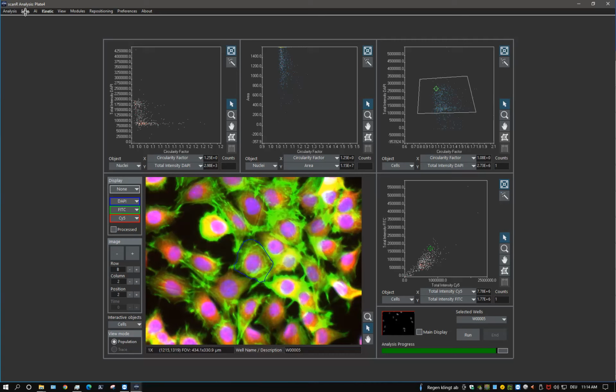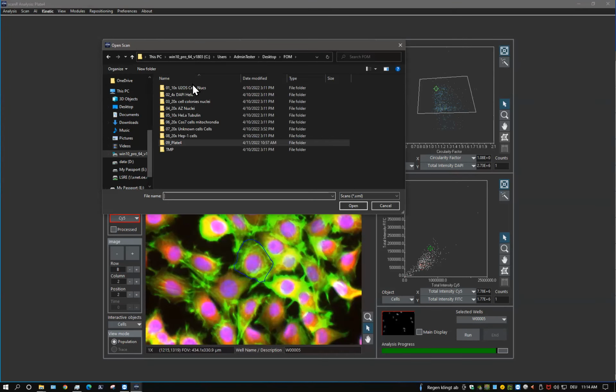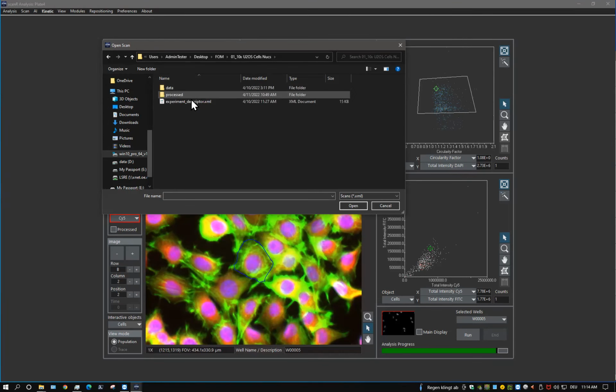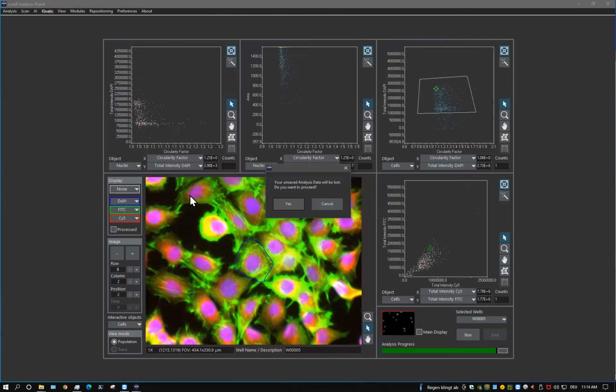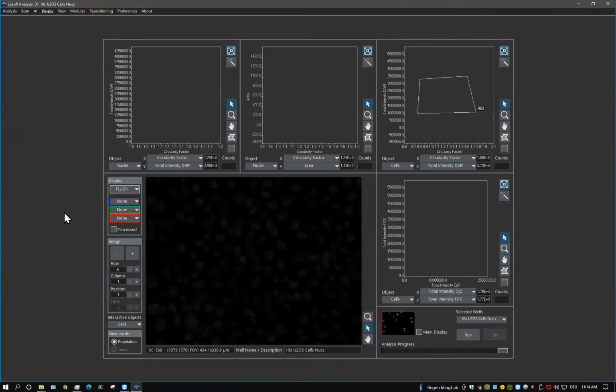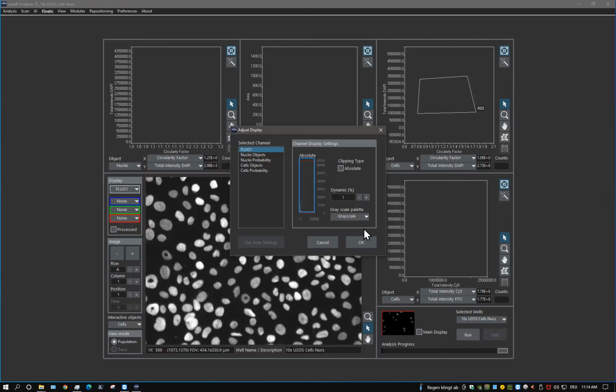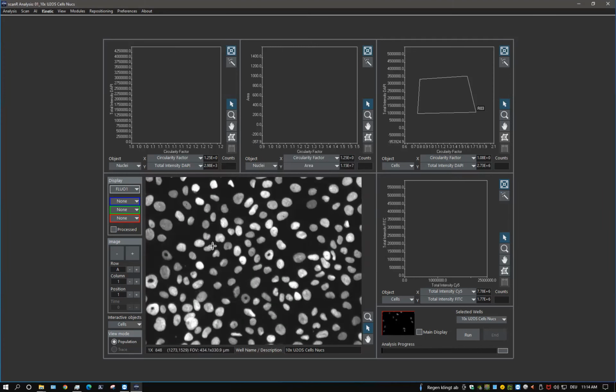I would like to open a very standard scan at the beginning. So what I do here is I open a scan. A scan is a set of images from one acquisition. So a scan can be a well plate, for example. It has typically multiple images. So in this case, it only has approximately 20 images, but it can easily be hundreds of thousands of images.